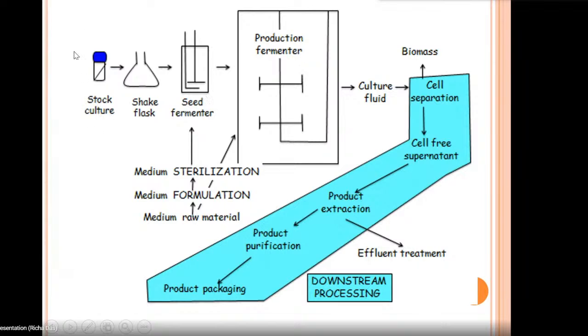Starting from the first image, that is stock culture. Let me tell you what stock culture is. As I said, microorganisms will be required in the process of fermentation. That means I have to isolate my pure form of organism from the mixtures, and then cultivate that pure form as well. That pure form of organisms, containing only my desired microorganism, is called the stock culture.